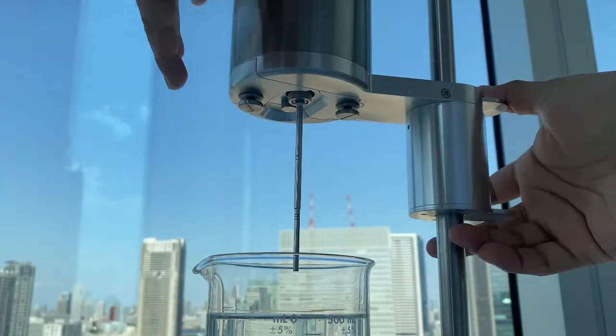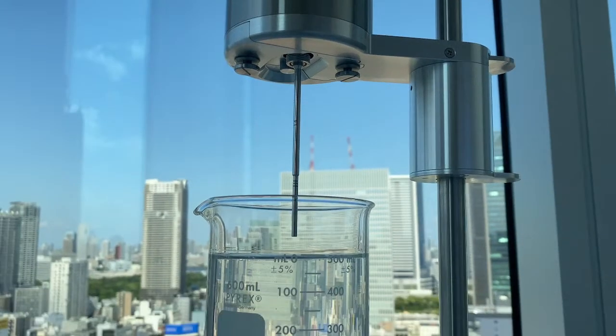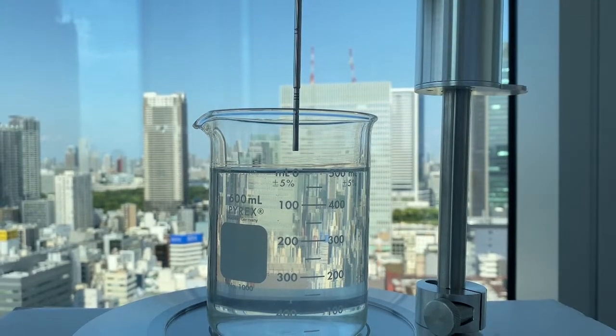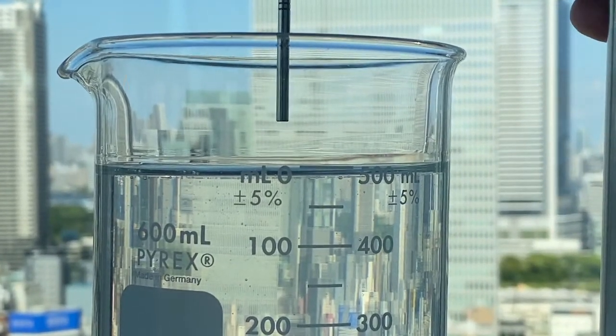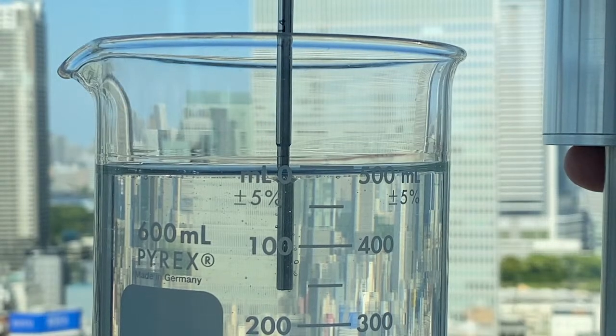So we lowered the instrument, attach a spindle. This spindle is for high viscosity products, and we have a different resin here. Now, we gotta make sure that we lower it so it gets to the second guideline.